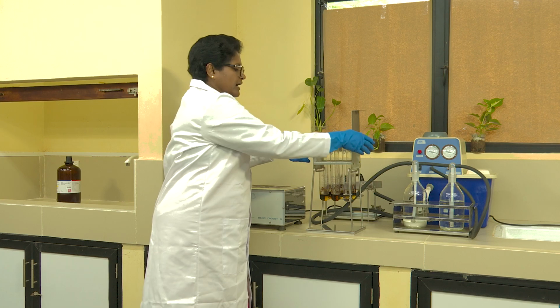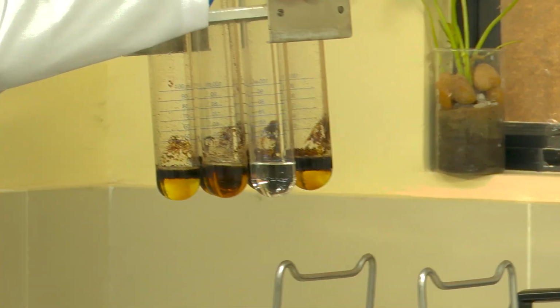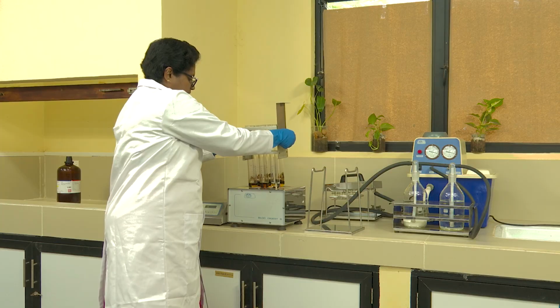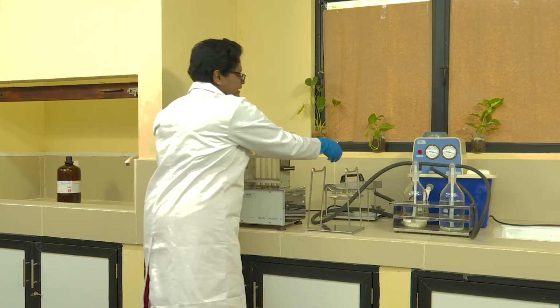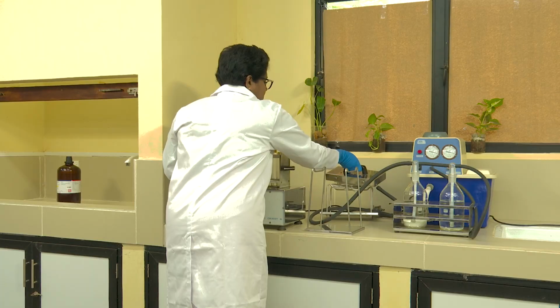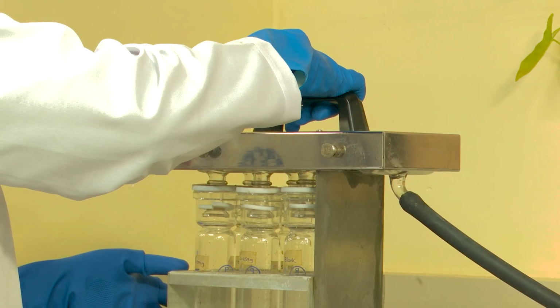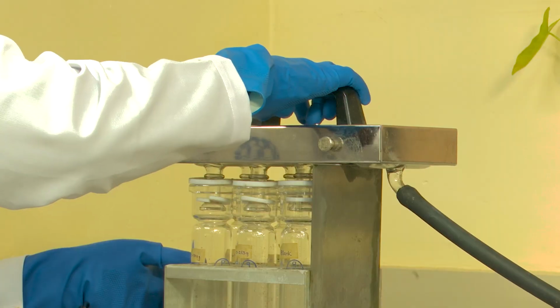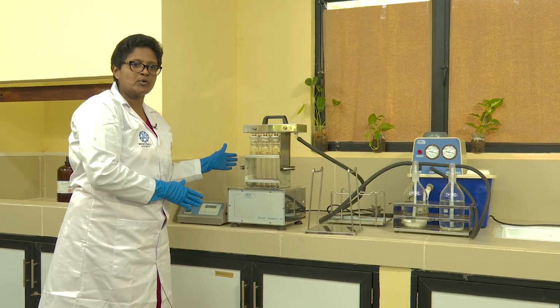Now place the digestion tubes in the block digester. Then connect the scrubber unit with the digestion tubes.